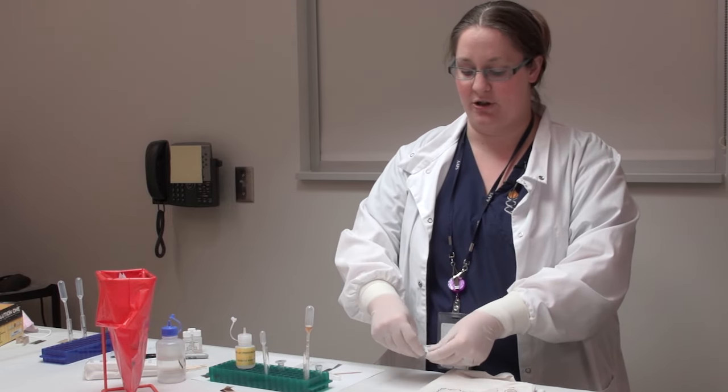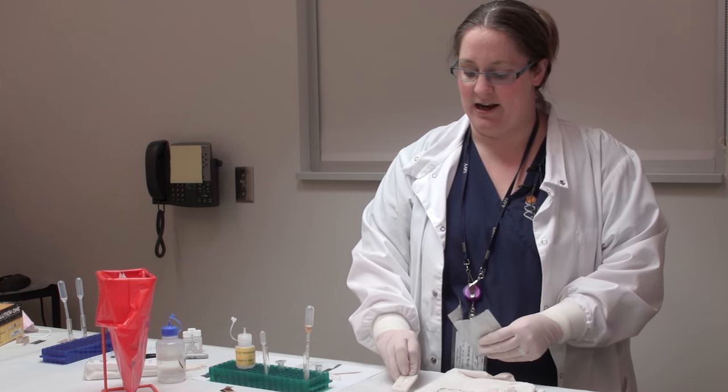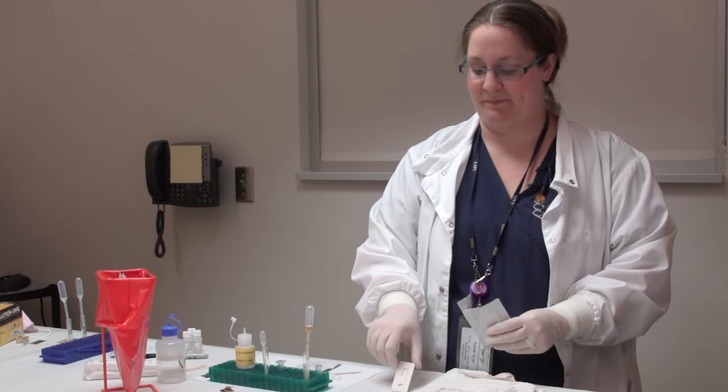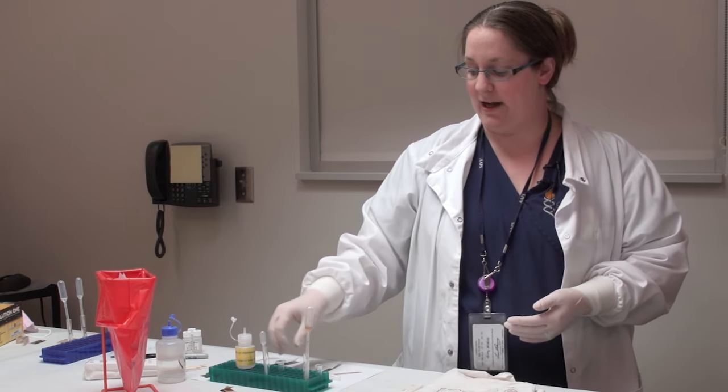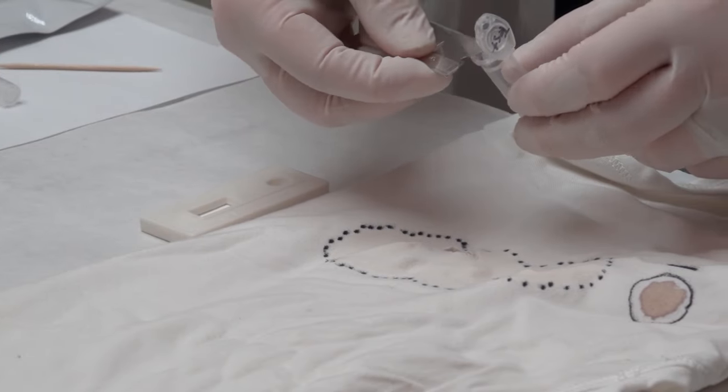We have a second presumptive test called the P30 test. It's a test for prostate-specific antigen, or PSA, that is found in seminal fluid. However, PSA can be found in other body fluids such as breast milk, so it is still a presumptive test. The P30 test is very similar to the hematrace test - it's just a cartridge that looks like a pregnancy test. It works in the same way as an antigen-antibody reaction. What we would do is take another cutting and place it directly into a tube.